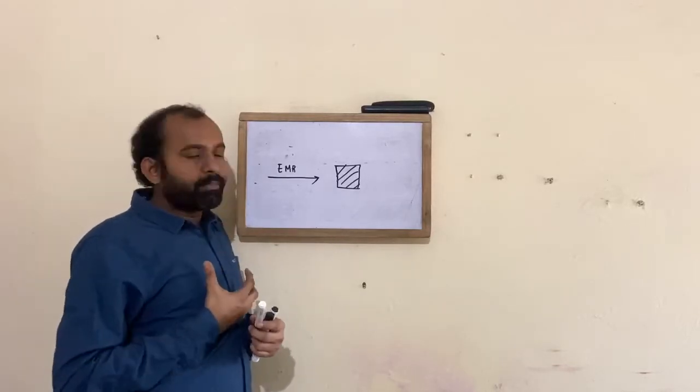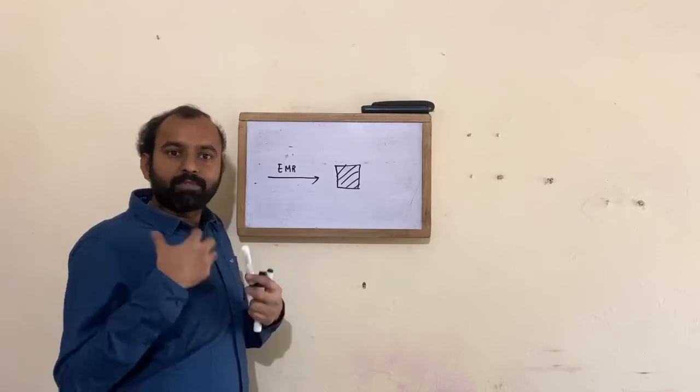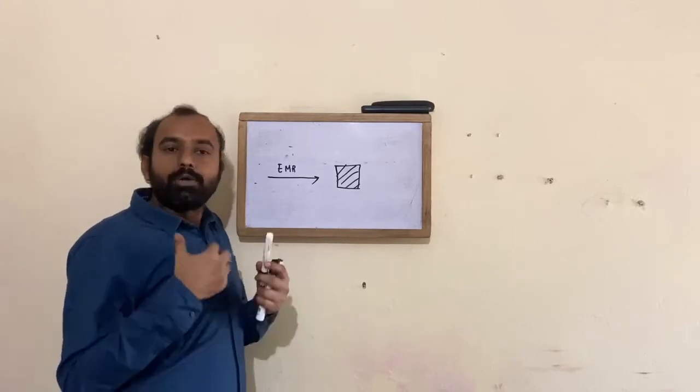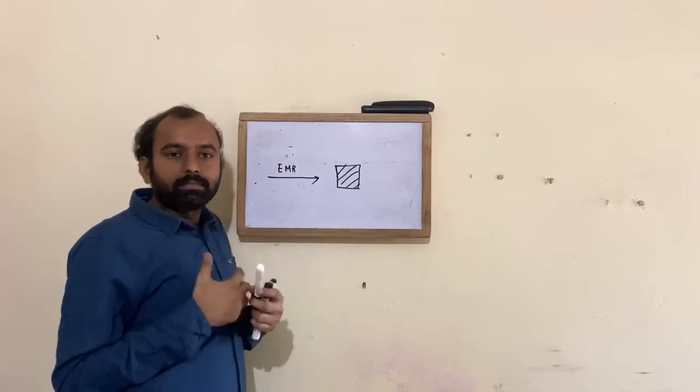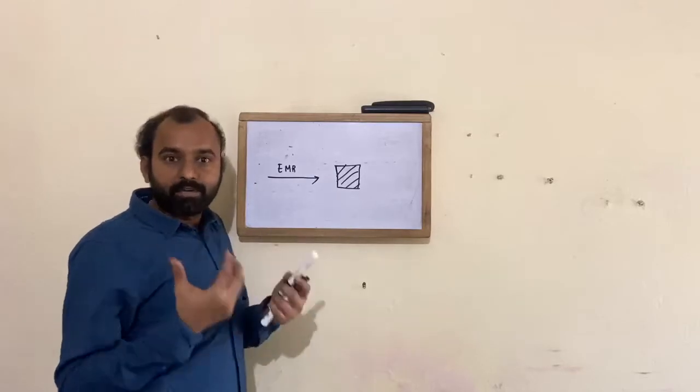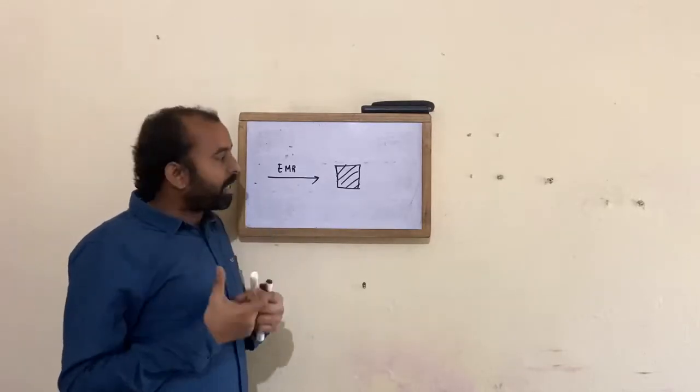You can classify them into different types of spectroscopy: vibrational spectroscopy, coherent spectroscopy, resonance spectroscopy, UV spectroscopy, visible, IR. IR is again vibrational. You can see Raman spectroscopy, again a vibrational spectroscopy. So these are the fundamental techniques.